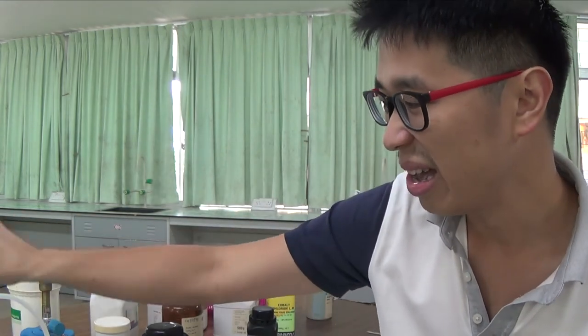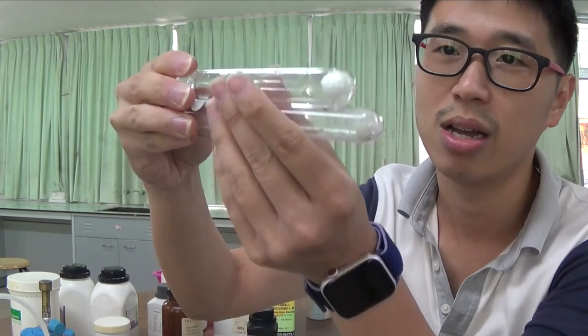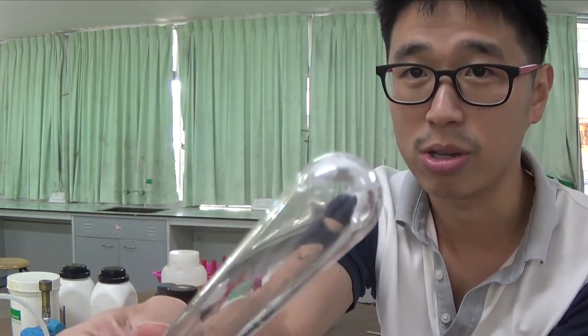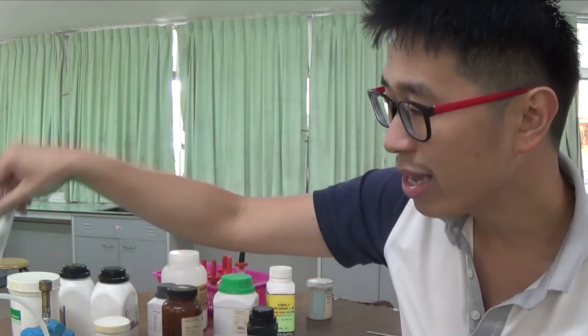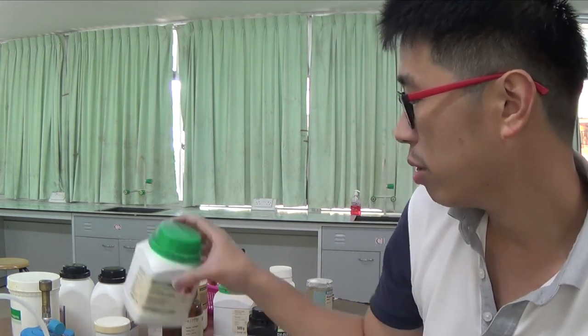You don't see the water, okay? Because we didn't exactly test for water, but we heated a white solid strongly. Therefore, we see a colorless liquid form on the upper part of the tube. It simply tells you there's water of crystallization present. And then what can you say about the solid? When that dries out, the solid gets stuck on the side at the bottom of the test tube. There is another observation that you can make. The solid remains white, unlike the colored transition metal compounds just now, that change color when they become anhydrous. Alright, so that's it in this tutorial video.